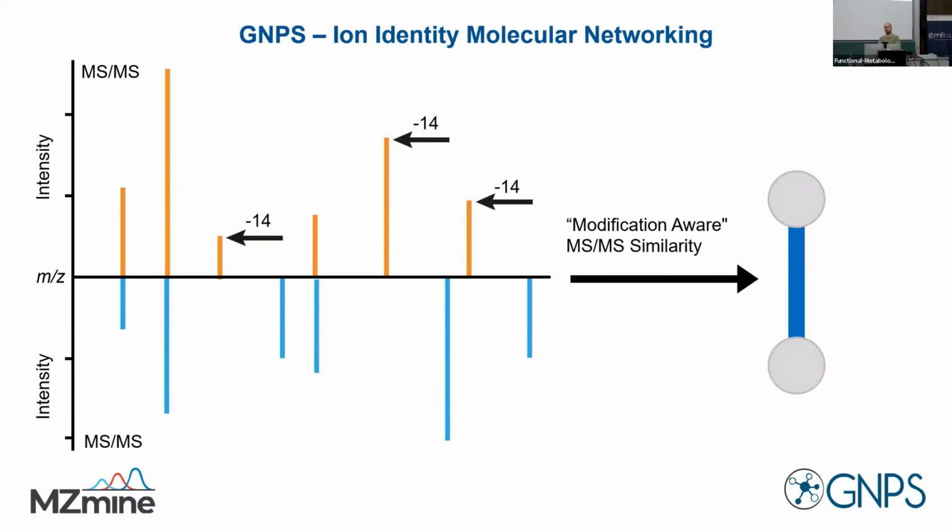Do you always have to go back and restart the entire job for that? Yes, kind of. Well, in Cytoscape, you could also raise the threshold by removing edges, but we typically just rerun the jobs. I'm going to show you in a second, there's a very convenient function in GNPS to do that quickly. And also, talking to Ming, who developed GNPS, he said, just rerun it. It doesn't matter, we have the resources to do that. So he's also rerunning everything.